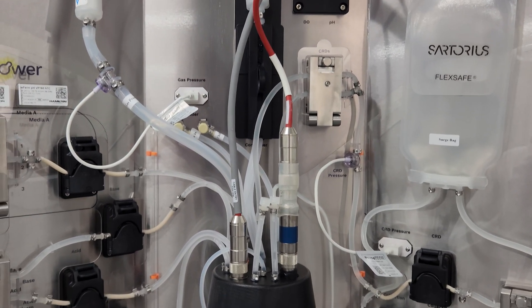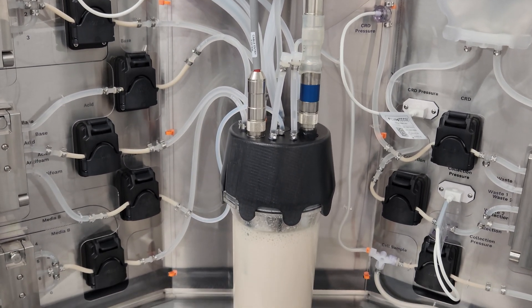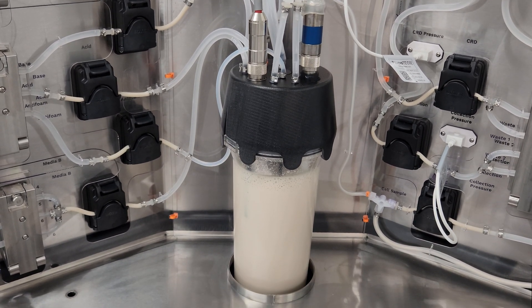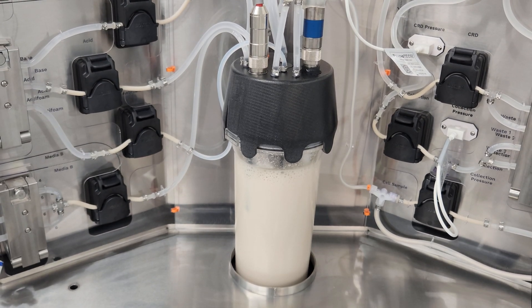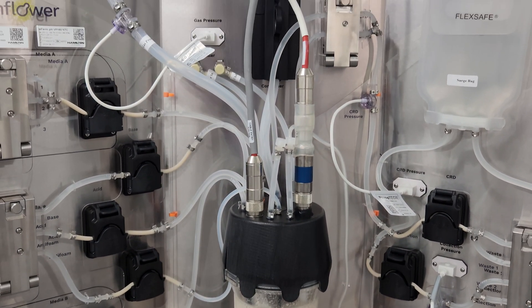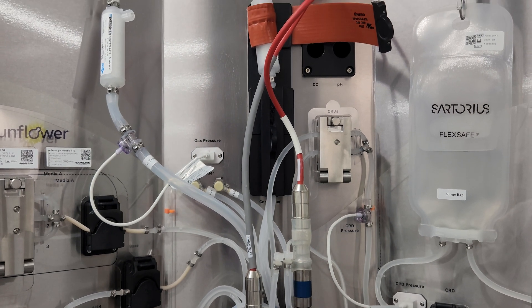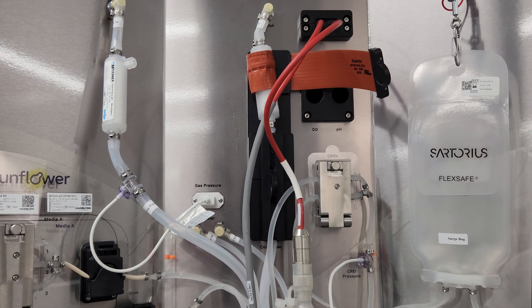The two CRDs in each bioreactor enable culture fluid to be removed from the vessel throughout the fermentation process without removing any cells from the reactor. This enables the continuous removal of fermentation waste and secreted products while allowing the cells to stay in the bioreactor — a carefully controlled environment that has all the right nutrients, gases, and environmental factors to keep them happy.